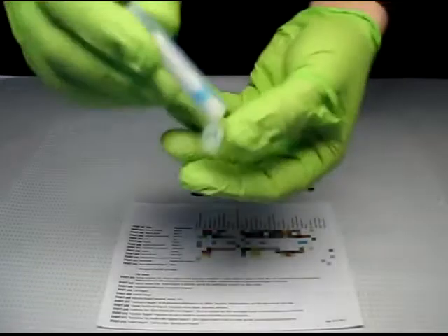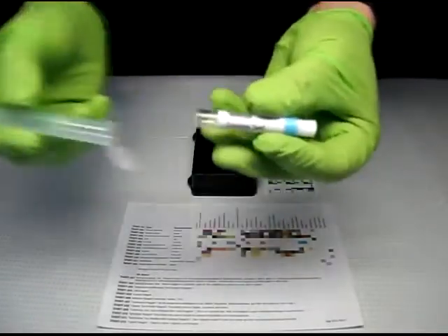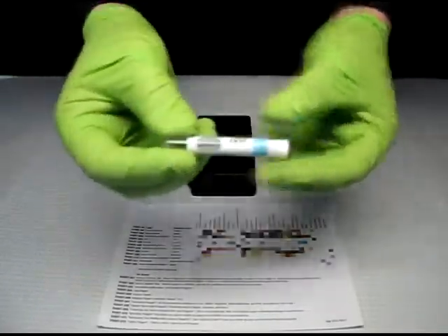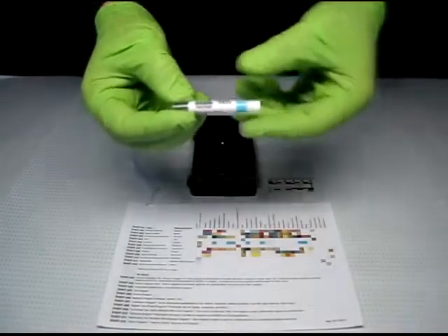Remove the sampler from the clear outer tube. Remove the protective paper from the sticky sampler tip. Dab the sticky sampler tip on the material to be tested.